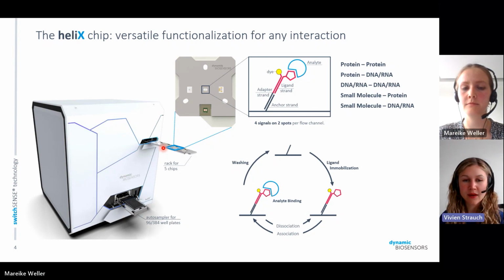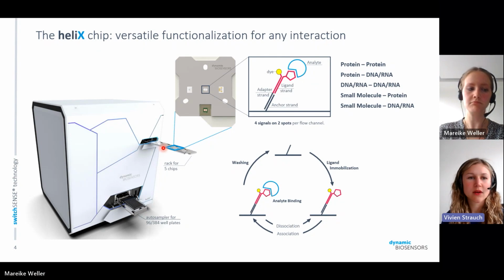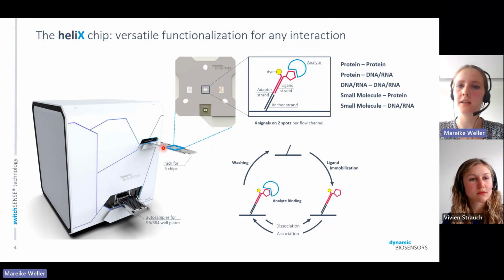And there has been a follow-up question about the pH. Did you check the effect of the pH on the binding affinity and on the fluorescence quenching? For this measurement setup, I did not change the pH, no. But there was no influence on the binding visible, right? Since I only tried 2 different salt concentrations, but not the pH, I cannot say for sure, but I guess this is also very dependent on which ligand and analytes you use.